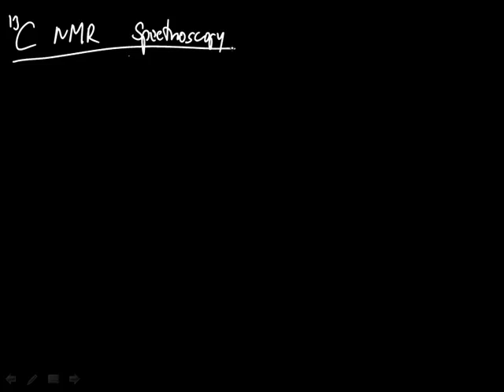Good afternoon. In today's final lecture of the course, we'll talk about carbon-13 NMR spectroscopy. Last time we talked about proton NMR spectroscopy, which is historically the first one and still the most commonly used spectroscopy technique.